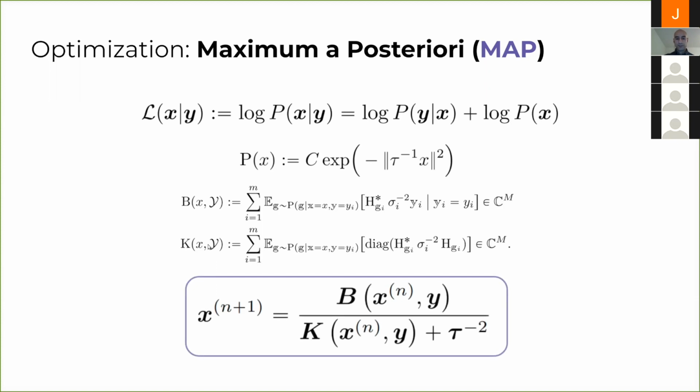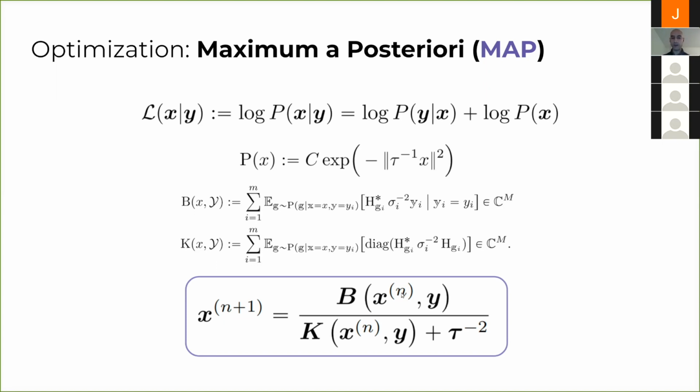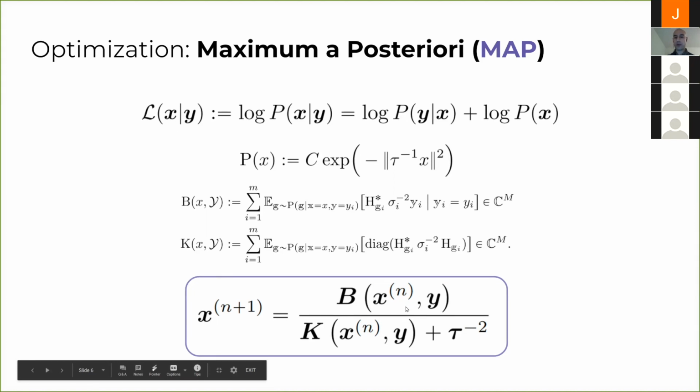And when you do this, the update, if you remember in the image that I showed you, if you consider an iteration n, like in the first iteration, n would be 1, and then second iteration would be 2. You can, using these expressions, define what your next guess should look like using the current model.